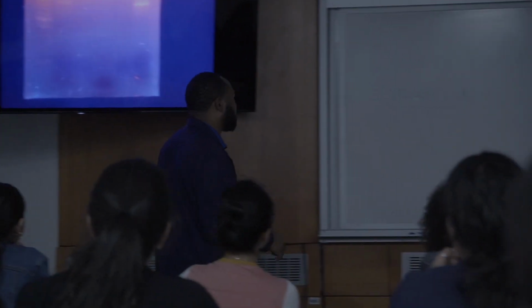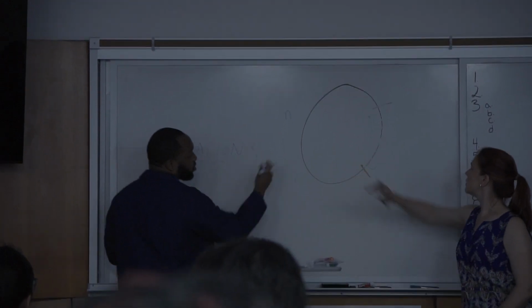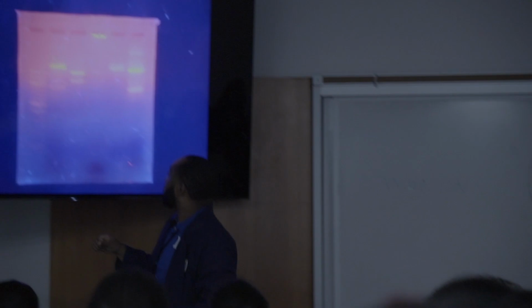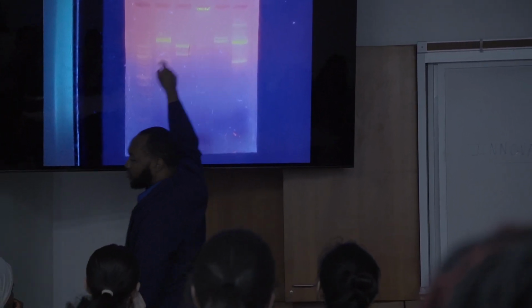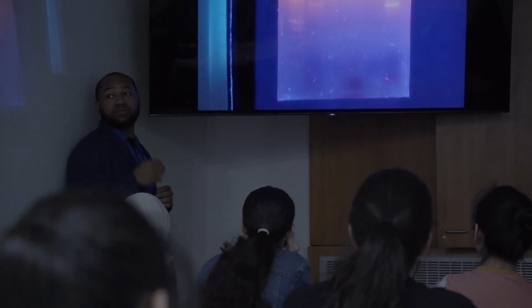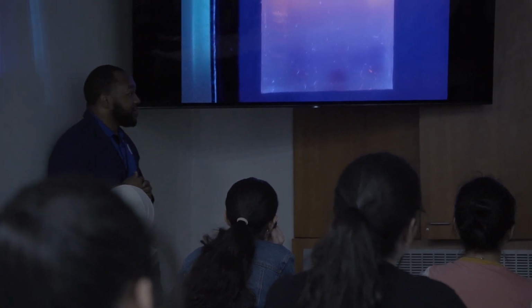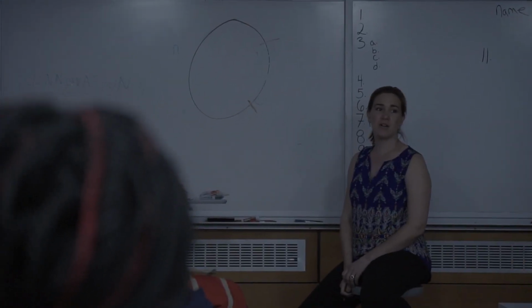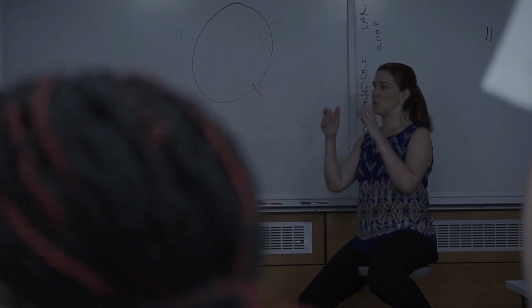So in our case, we basically had this, right? We had one slightly shorter and one slightly larger. But what if I told you this is the longer fragment and this is the shorter one? What's the thing at the top? Hypothetically, maybe the plasmid didn't get cut at all. Yeah, so the whole thing's going to be even bigger, right? And do you think a circle moves faster or slower through pores? Slower, right? Because the circle has more places it can get stuck.